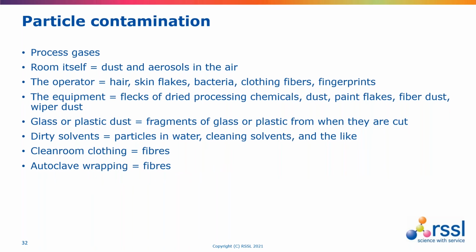So similarly, we need to be mindful of particles as well. And this isn't just airborne particles, which might traditionally be part of the microbiological program, but also particles from things like gases as well. So we may have nitrogen, we may have compressed air, for example. So we need to understand what we're filtering and how often we're testing that.